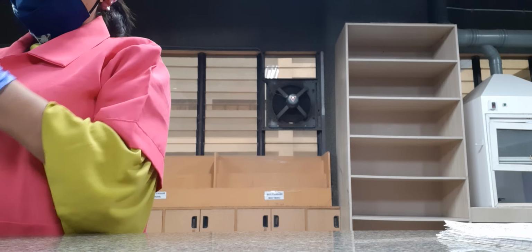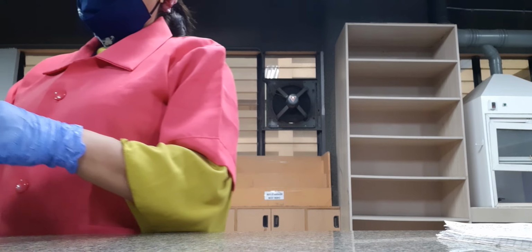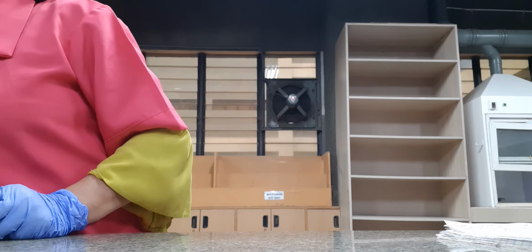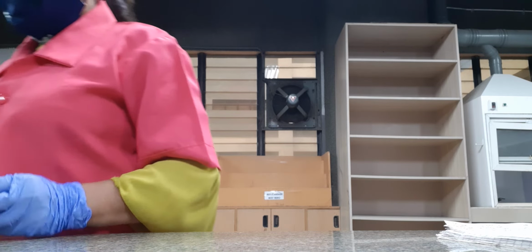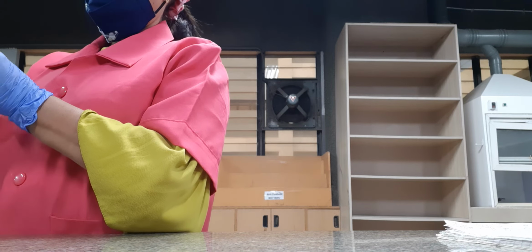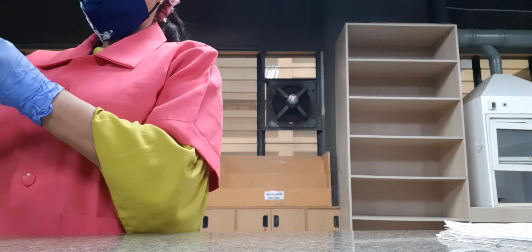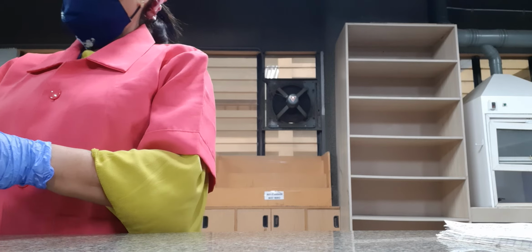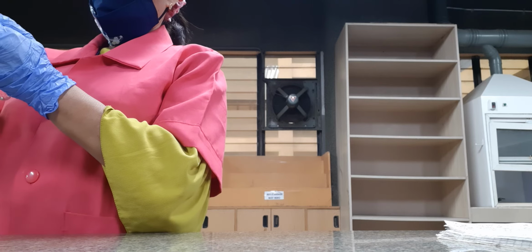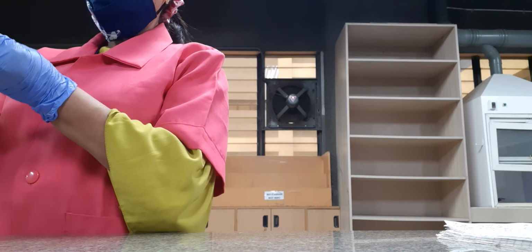So, so we have acetaldehyde. Kalusod ba na ano yung mag-gloves ka?